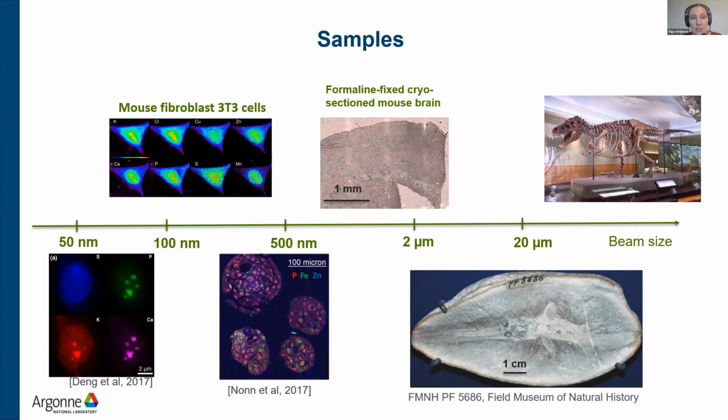organelles within the cells. We can visualize mammalian cells and plankton. We can visualize clusters of the cells, three-dimensional cultures of the cells known as organoids, which allow people to go through multiple drug probes and so on before those studies can move on to clinical studies on the animals, and eventually humans. We can do visualization of quite large tissue sections and tissue slabs using micro-CT.